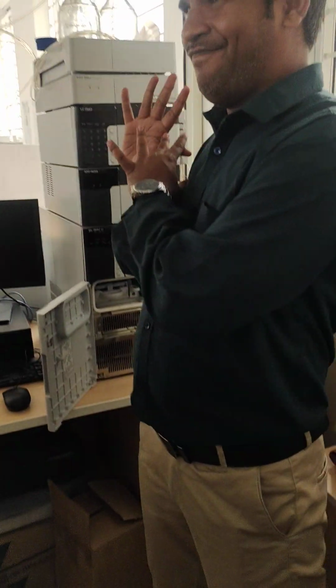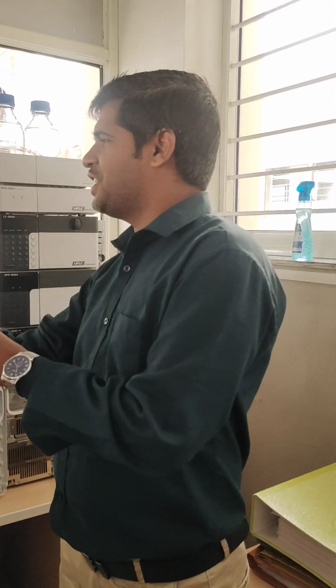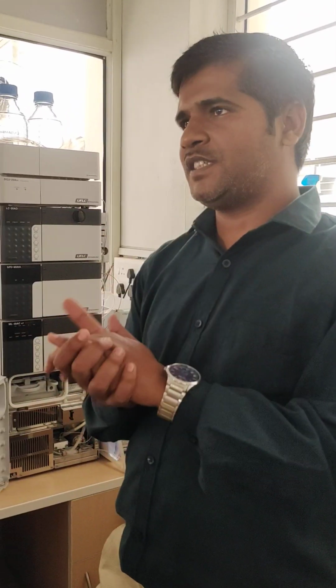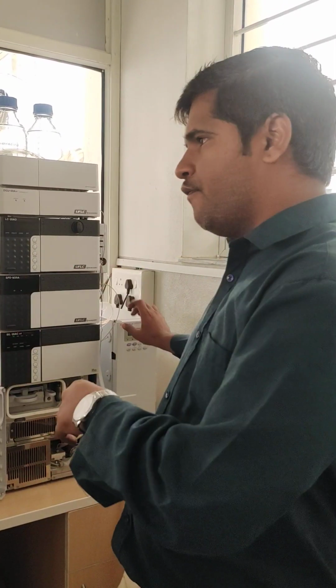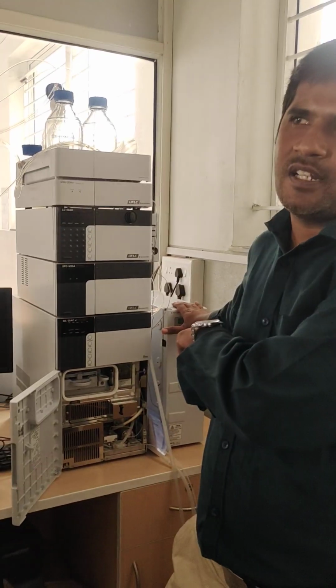Just like an oven. Do you know an oven? We adjust the temperature, like 60 or 70 degrees centigrade, and we keep our sample there to dry. Here we are maintaining the temperature on the basis of the sample. Like if you want to have the analysis at 30 degrees centigrade, we'll adjust it in the program and maintain the temperature at 30 degrees centigrade.